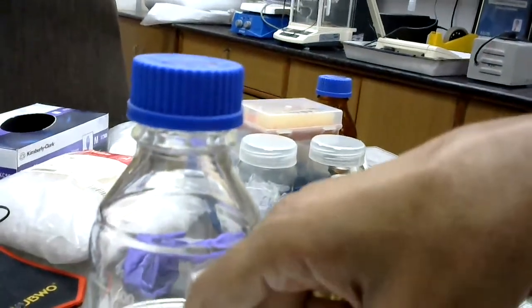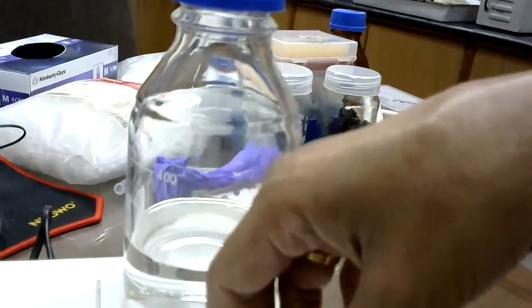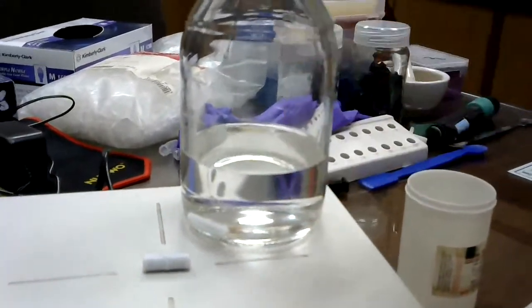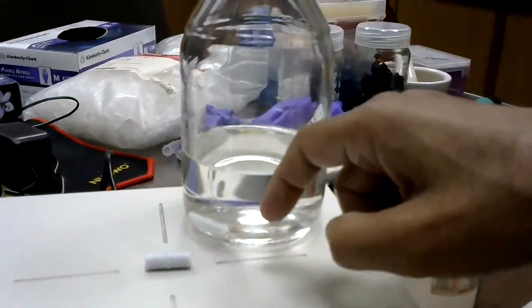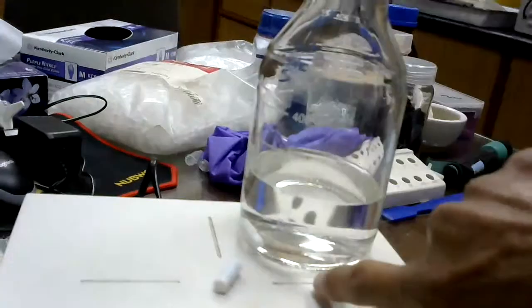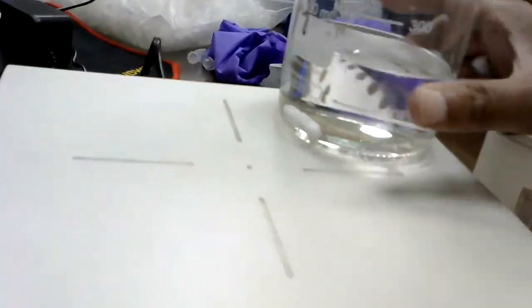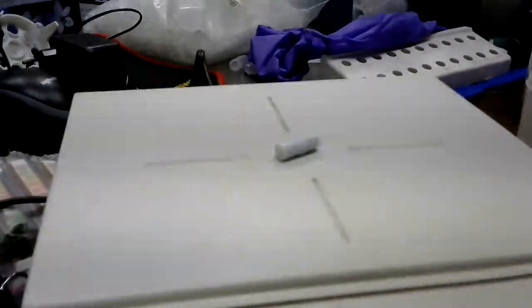So I cannot put my hand here and take it out. If I put my hand, this solution will be contaminated, or my hand may be damaged because of this solution. But I have to take out this bit inside here. You can see, this bit I have to take out. How to take it out? So imagine that this is inside the bottle.